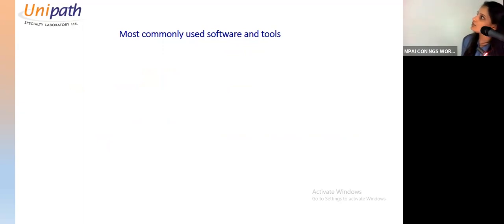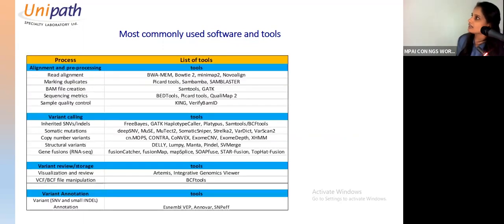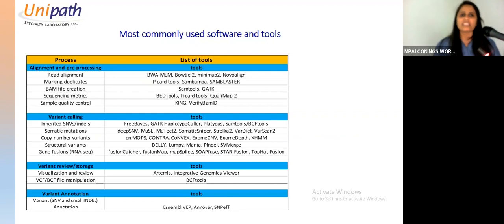Now the list of the tools and databases. Just to begin with, as I told you, when you get the data from any sequencer, irrespective of any application which you are using, it can be diagnostic, it can be research, anything, the first step is demultiplexing.